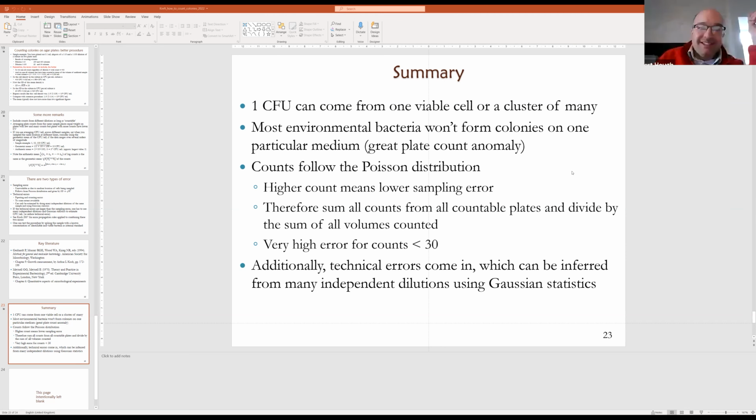Yeah, can I ask a question or get your thoughts about a couple of things? Okay. I was really interested to listen to the stuff about the CFU, just as someone who uses CFU data all the time, and maybe doesn't bear that much thought to how it's collected, or well, often it's not reported how it's enumerated. So you kind of make the assumption that best practice is being followed, I guess.